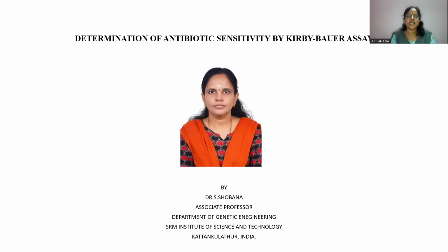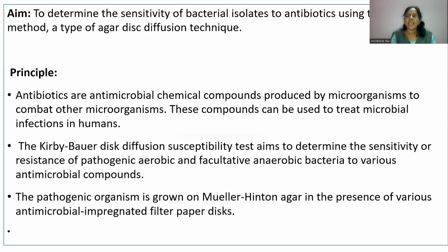Welcome to Microbiology Lab. In today's lab session, you'll be learning about determination of antibiotic sensitivity assay by Kirby-Bauer assay. So the aim of this experiment is to determine the sensitivity of bacterial isolates to antibiotic using the Kirby-Bauer assay method, that is an agar disc diffusion technique.